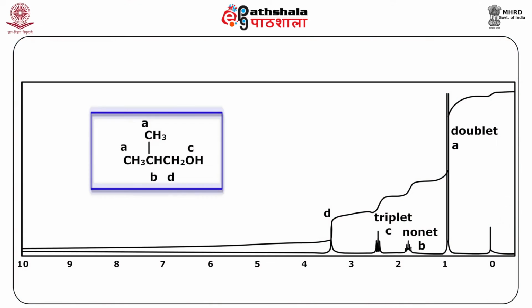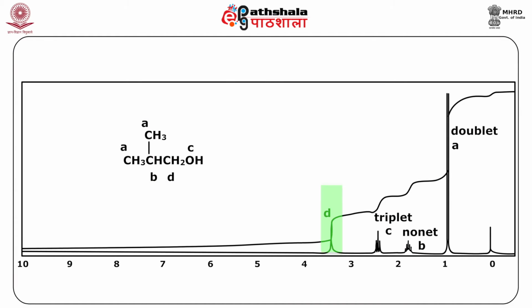Now you can see in this figure the proton NMR spectrum of 2-methyl-1-propanol. Protons attached to the alpha carbon appear in the most downfield region, at 3.4 ppm. The hydroxyl group appears as a triplet at 2.4 ppm. Here some coupling is observed for the hydroxyl proton due to the hydrogens on the adjacent carbon. Now you can see clearly what I am trying to say from this figure.